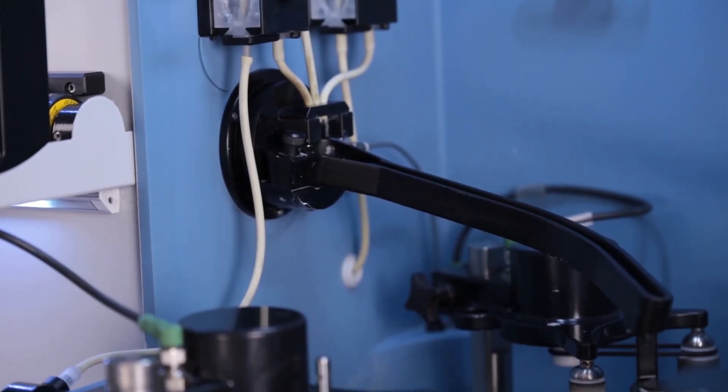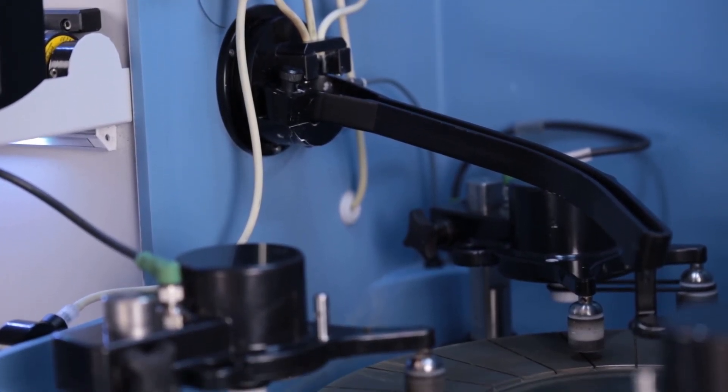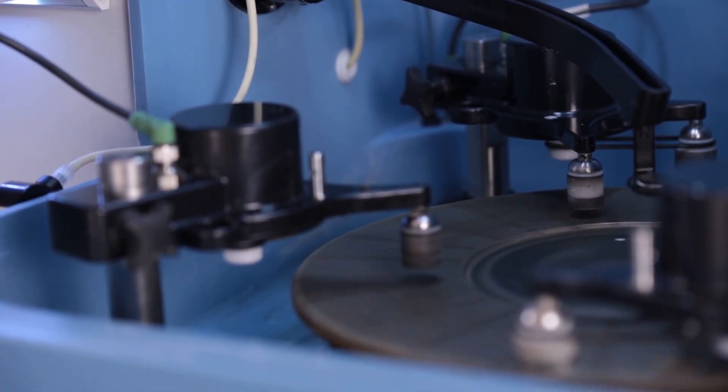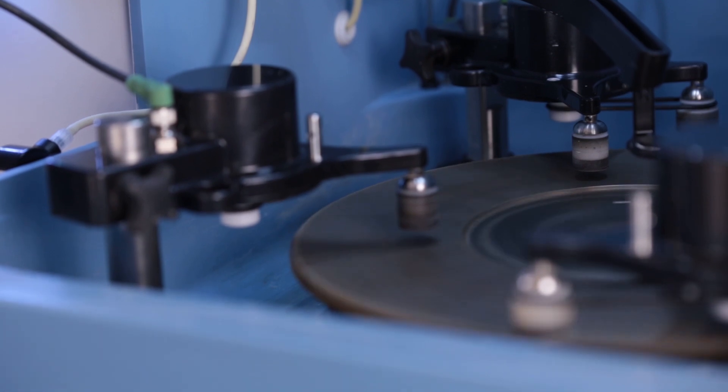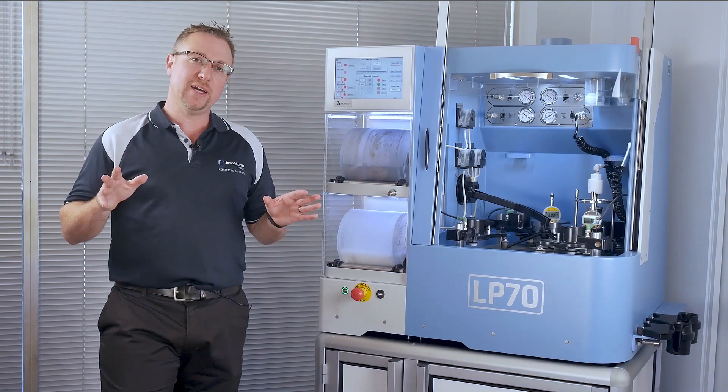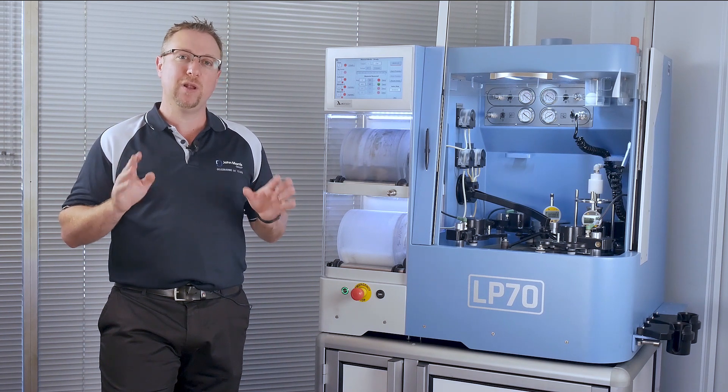So, this is the LP70 from Logitech, a wonderful piece of equipment to achieve high degree of accuracy including high levels of surface quality, parallelism and low total thickness variation amongst other variables. You'll find a link to all the details and specifications about the Logitech LP70 below.